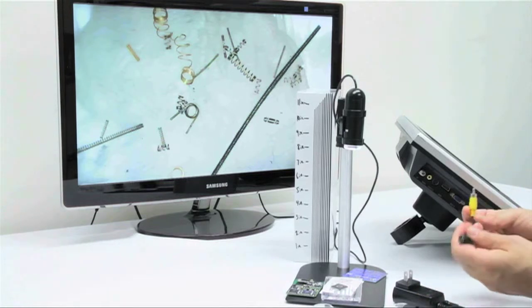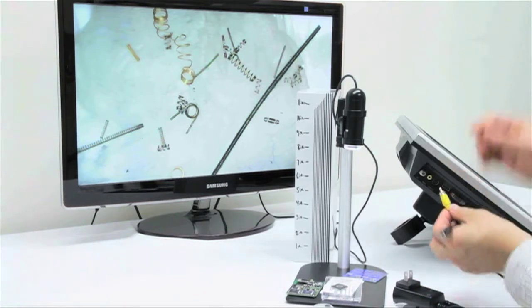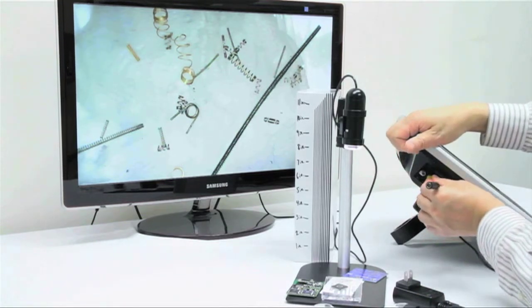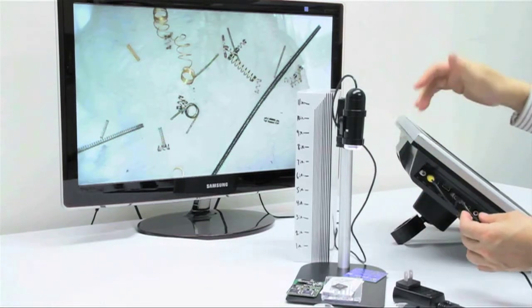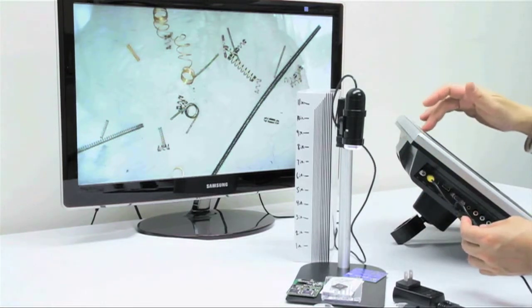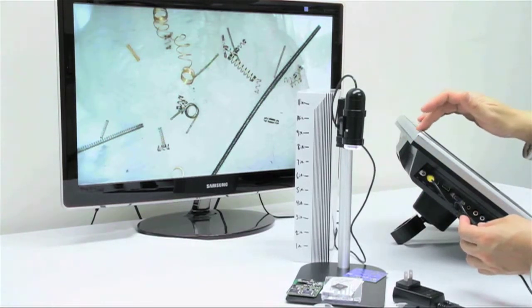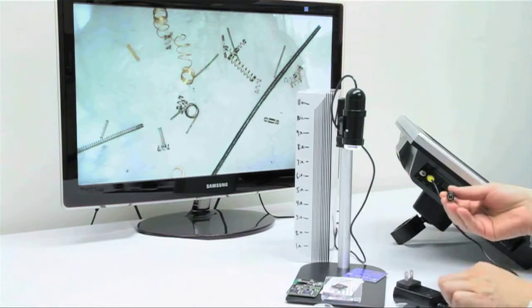After plugging in the RCA cable to the TV or device in question, change to the right component setting. Then simply connect the power cords together and plug in the wall unit.